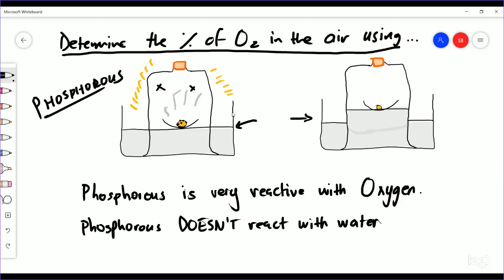So you can see that the phosphorus piece, the small piece that we used here, has become even smaller and the water level has risen up to this level. So you could measure the initial volume and then measure the final volume, and again what you would get here is 21% for oxygen.